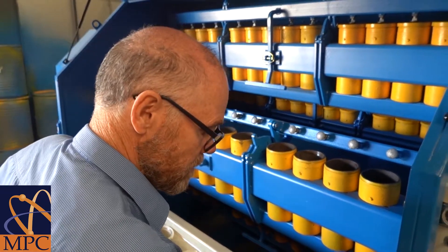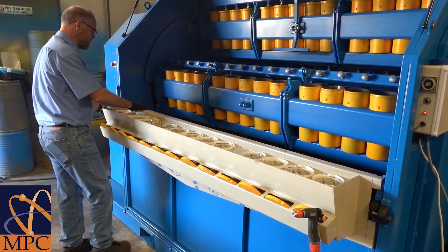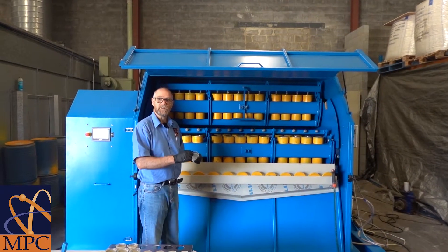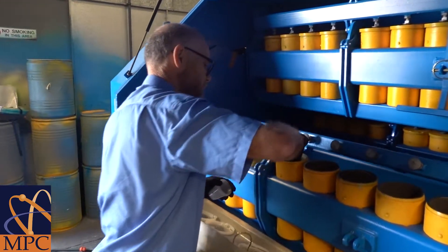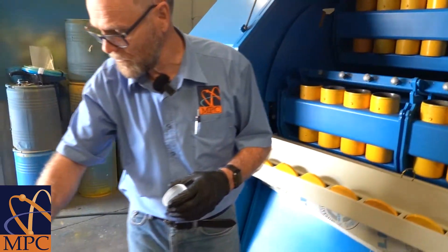We then remove the lids like we did previously, move the trough and the bottom door in. We then take a sample from each of the pots and place them in the rack ready for the centrifuge.